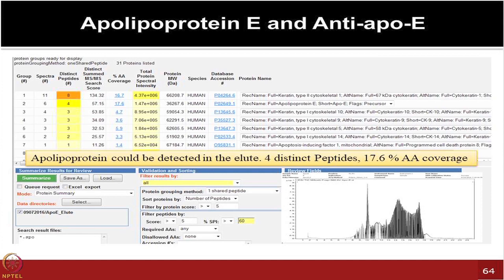So then we tried out another protein which was of physiological interest, Apolipoprotein E, and the intention was again to look for their binding. This time we could see 4 distinct peptides. At least the good news was, and we are using QTOF platforms, not the latest Orbitrap technologies, we could see the right protein and detect the right peptides.